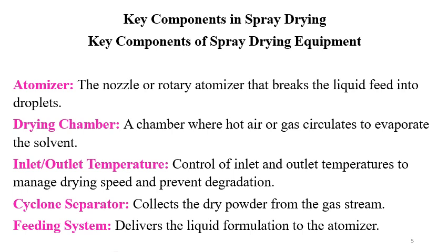Drying chamber is the chamber where hot air or gas circulates to evaporate the solvent. Inlet outlet temperature is the main process parameter and it is controlled through the temperature controller. Control of inlet and outlet temperatures manages drying speed and prevents degradation.